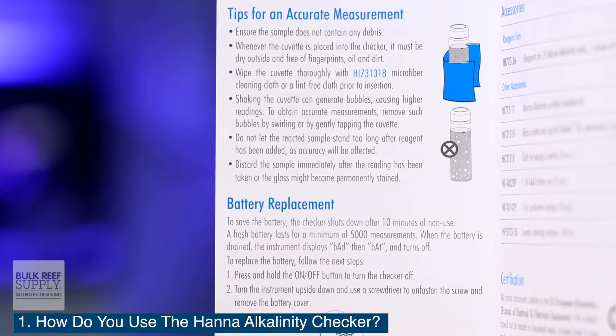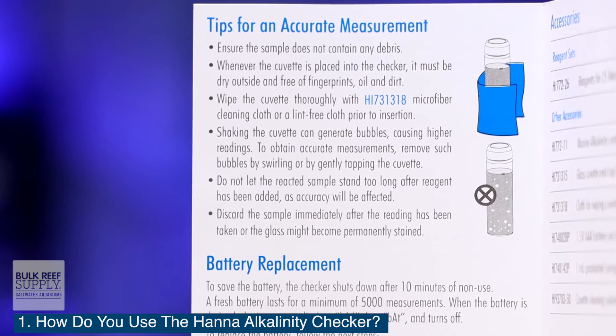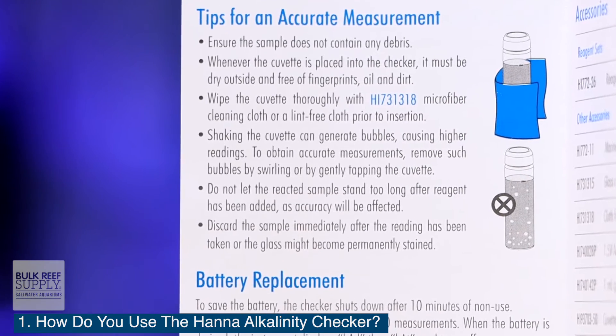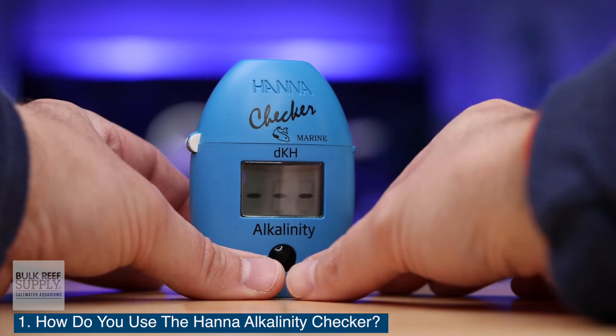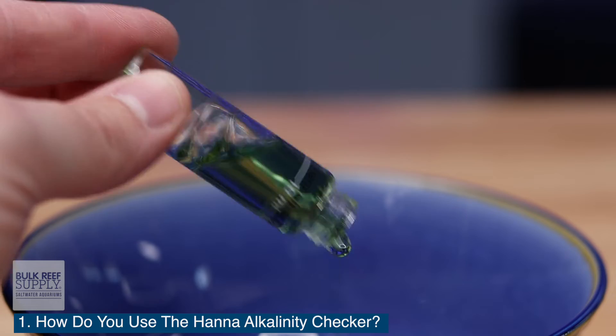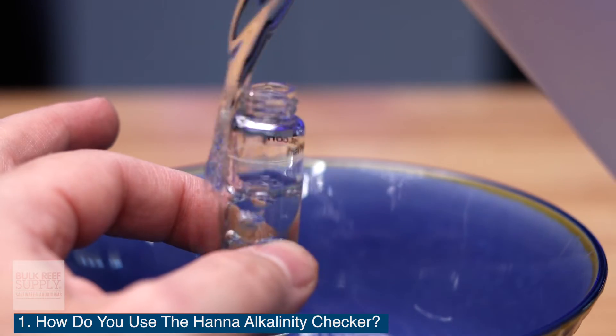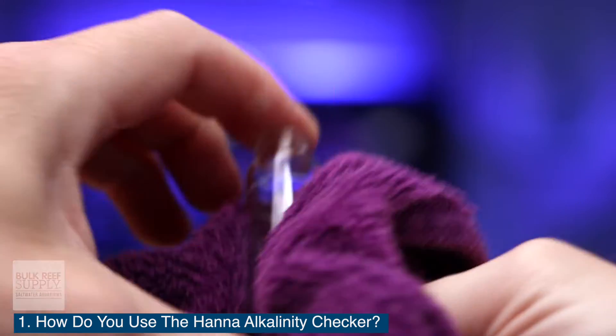Hold the cuvette by the top and bottom and wipe down the glass with a soft cloth, being sure to remove any smudges or liquid. Place the cuvette back into the checker, close the lid tightly, and press the on-off button again. In a few seconds, the result will be displayed as degrees of carbonate hardness, or DKH. Be sure to rinse the vial and the tools after every use with either distilled water or RODI water and allow them all to dry completely.